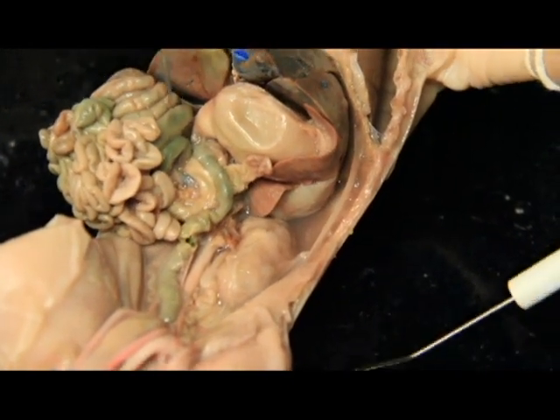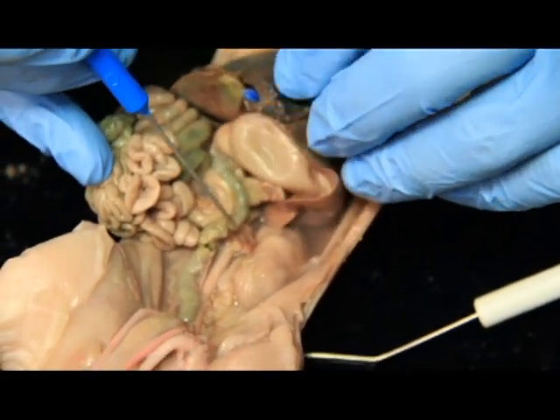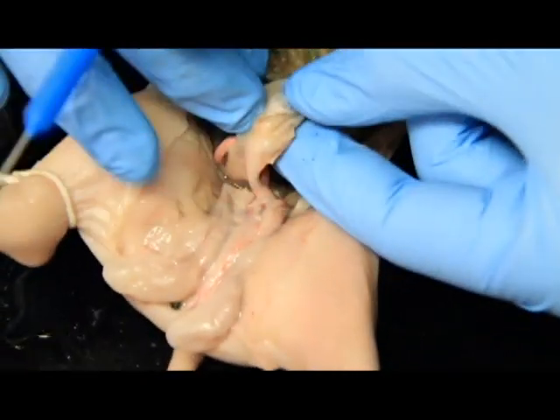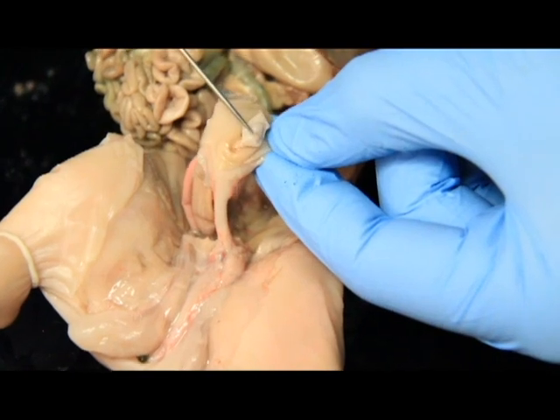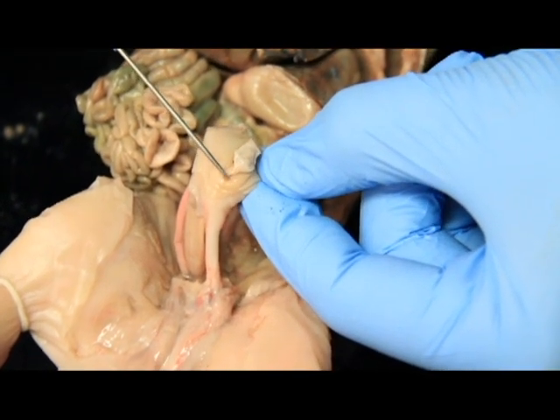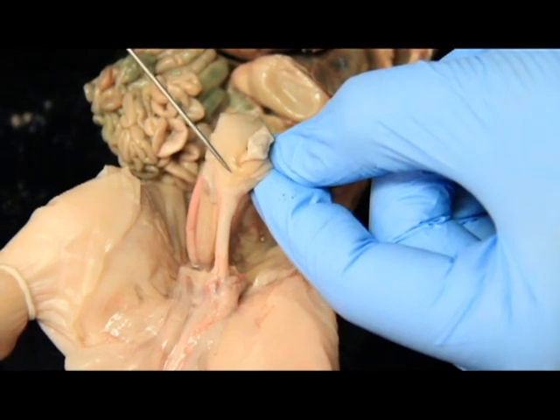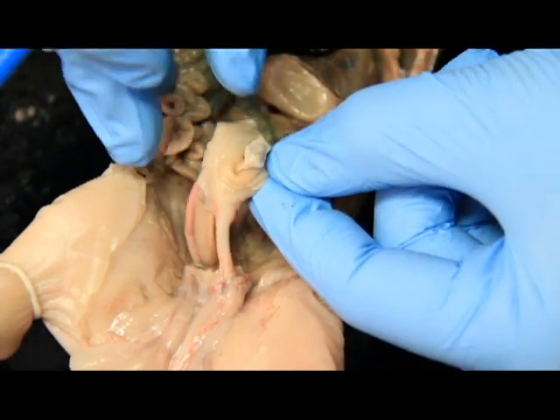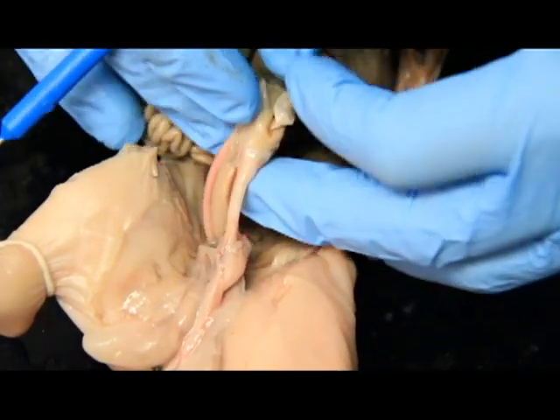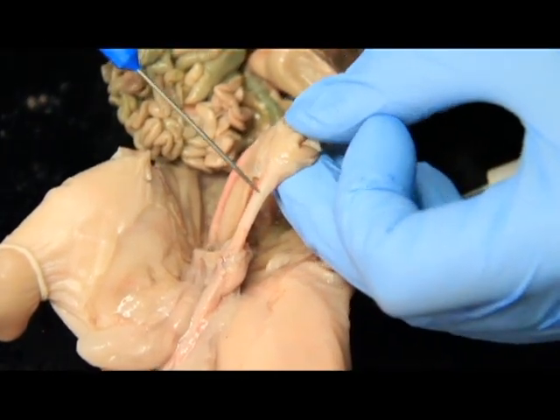Now as we work our way down here, this is a male. So what we've got is our urogenital opening here, right underneath the umbilical cord. So this is, remember, that external anatomy part. This is the umbilical cord. This is his urogenital opening here. If you were to follow this down, and if it's covered in skin, you can kind of rub your fingers back and forth and you feel this little tube. That little tube is actually going to be his penis.